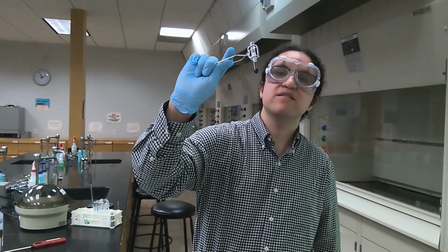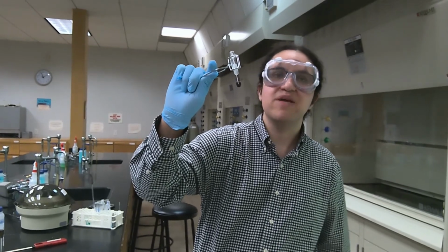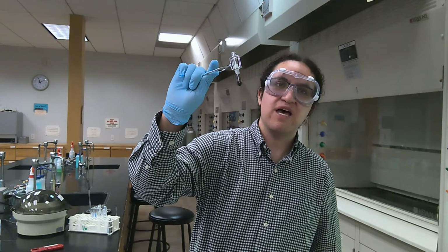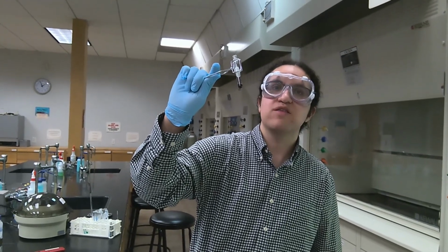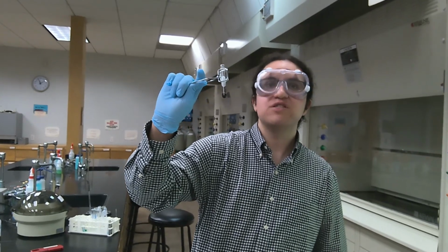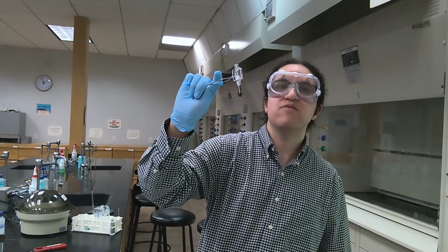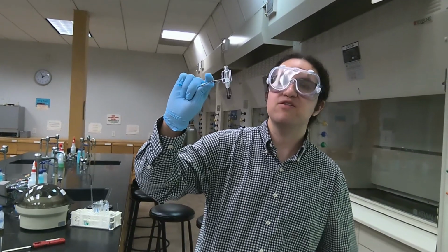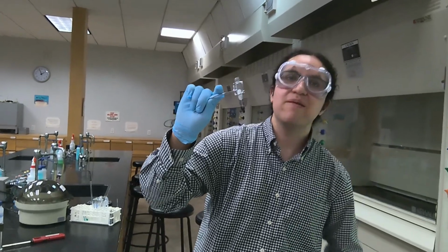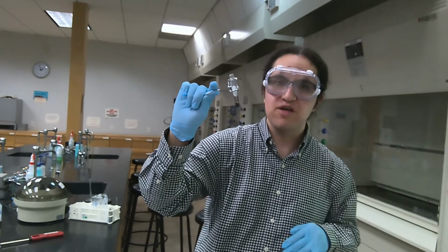And in our next step, we're going to be performing what I would consider a bit of an acid-base reaction, where we're reacting this metal oxide in water with sulfuric acid. Then we're going to proceed with a redox reaction with magnesium metal to regenerate our copper solid. You may want to consult the activity series to prove to yourself as to why magnesium metal can reduce copper 2+ back to copper solid.